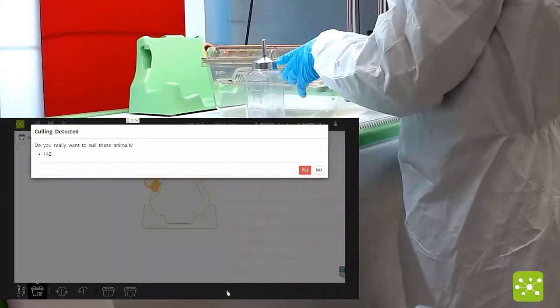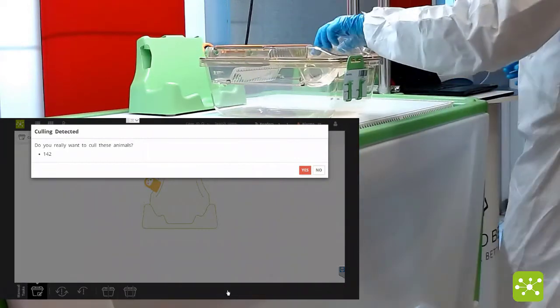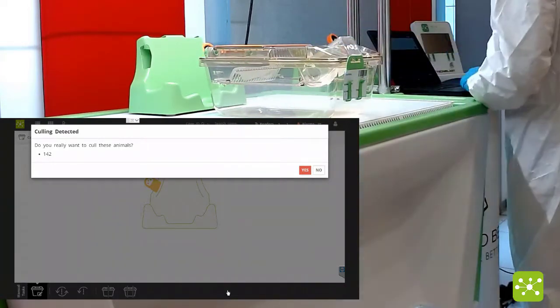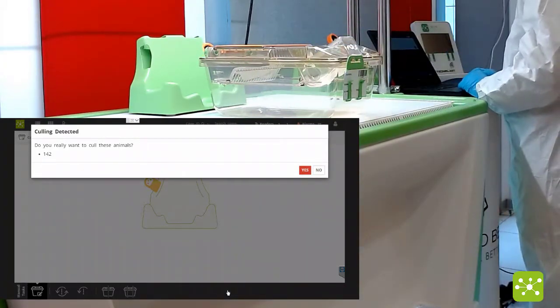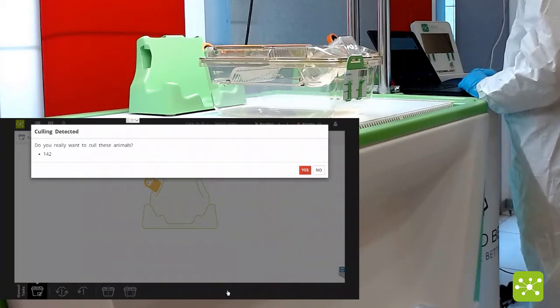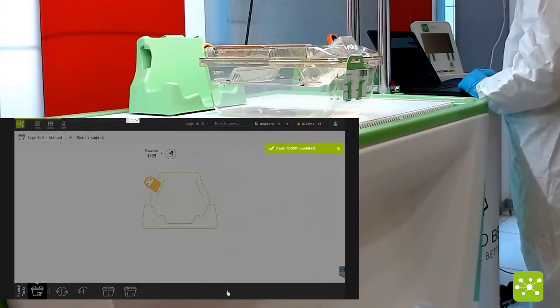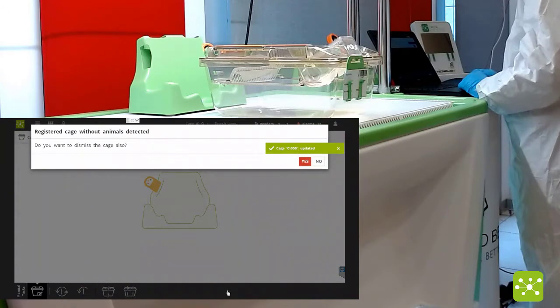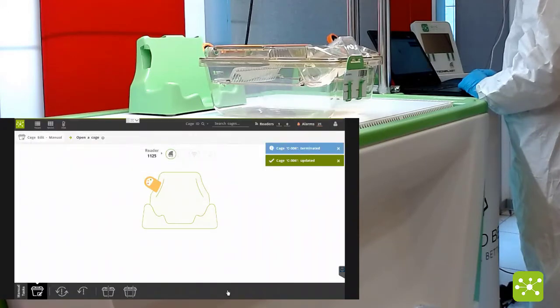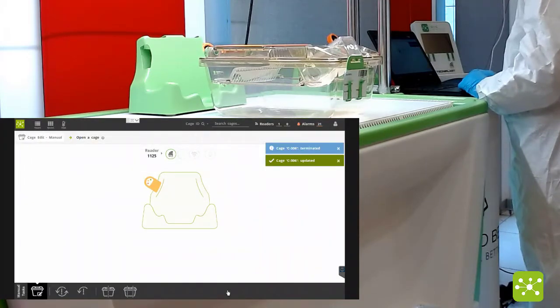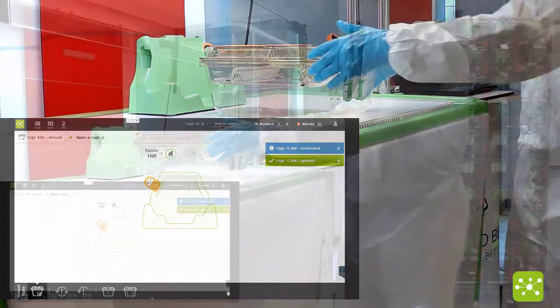Once you close the cage, due to the fact that the cage is now empty without any animal, the system is conveniently asking you if you want to terminate the corresponding cage. Clicking yes, the cage will be automatically terminated.